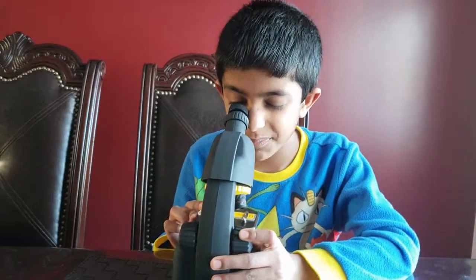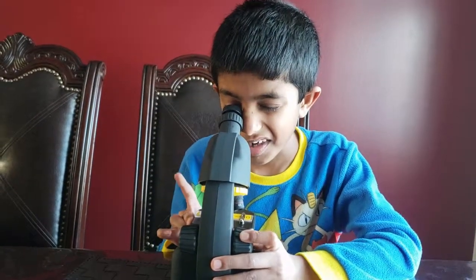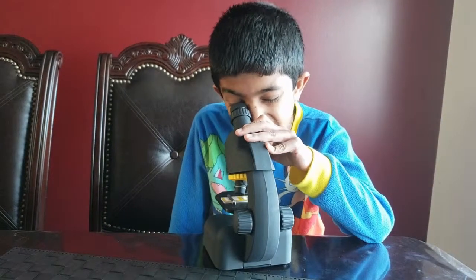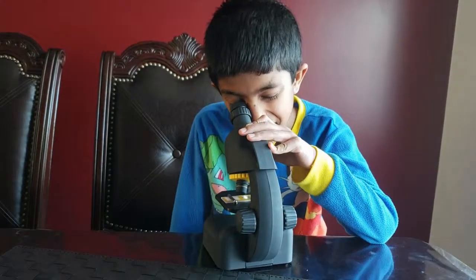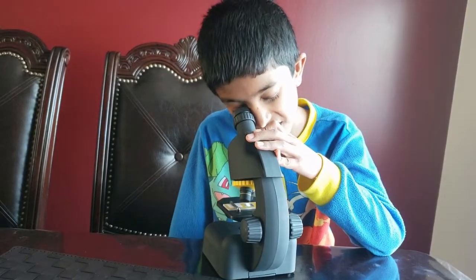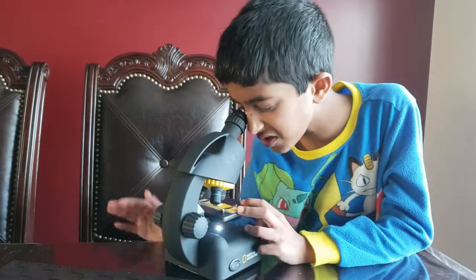Okay, everything is pitch black now. It's getting a little light, a little light, a little light. I see it — it's full detail. I see some — it's so much detail, it's hard to explain. I can also see the cells.